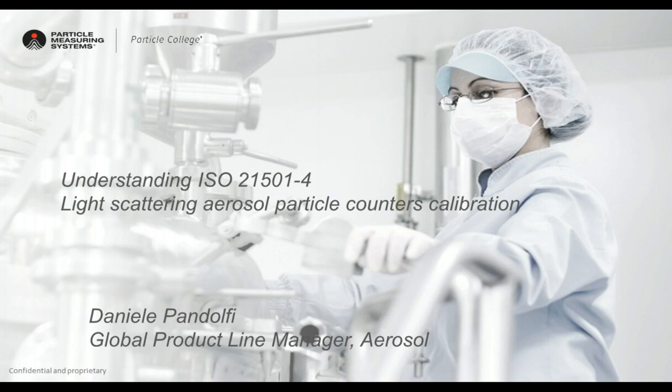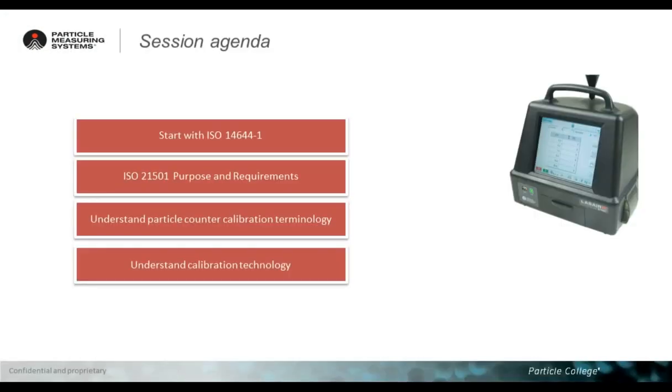The goal of today is not to make you an expert on how to calibrate a particle counter, but to give you as much information as possible to be able to read the documents you get from your supplier and understand how your particle counter is performing.